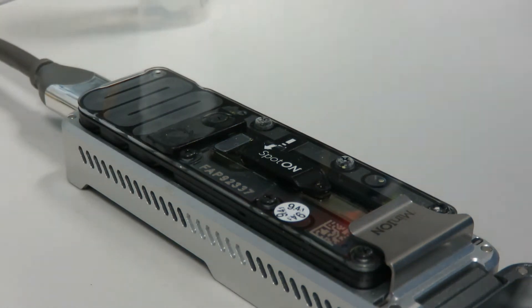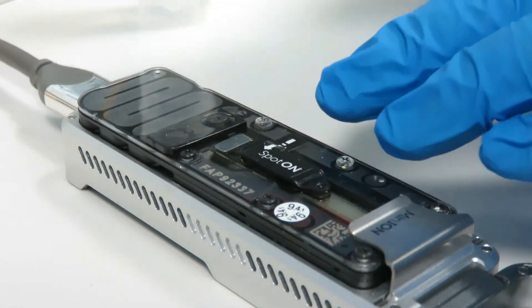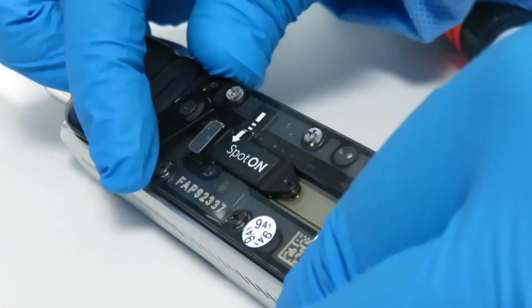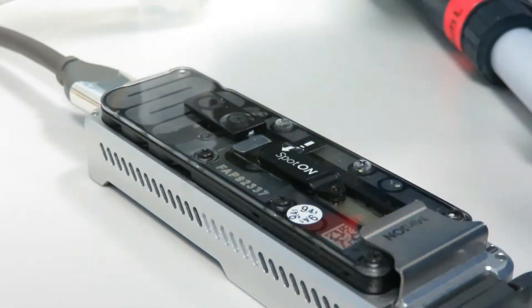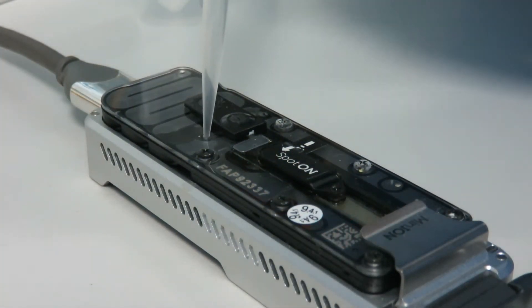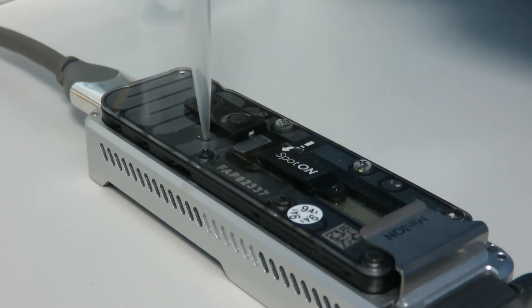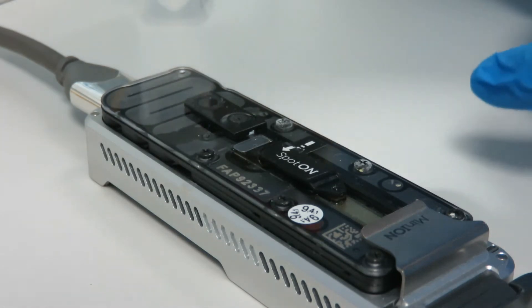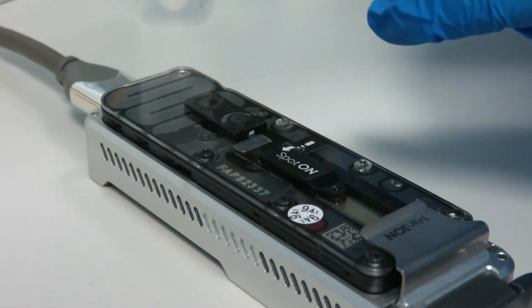The buffer port is called the priming port, and it flicks open like that — it twists round and there's a little hole underneath. This hole is designed to fit a P1000 tip, and if you put your P1000 tip in, it fits perfectly into that hole. You should always use a P1000 to load any buffer into the flow cell.